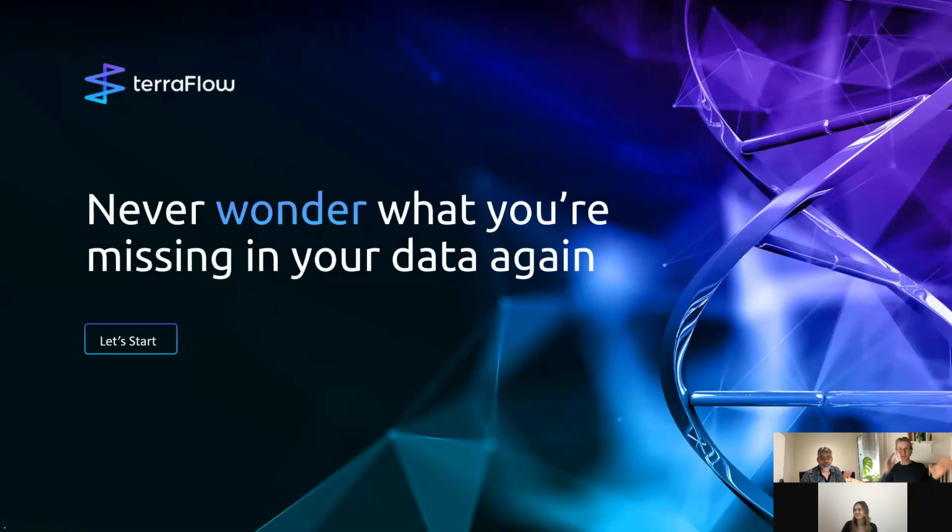So if you remember when I was uploading the data, there was that one column where I was typing in responder versus non-responder. Basically, what you do is you push a button, and another column pops up where you can input the batch that sample belongs to. For example, plate or date of experiment.